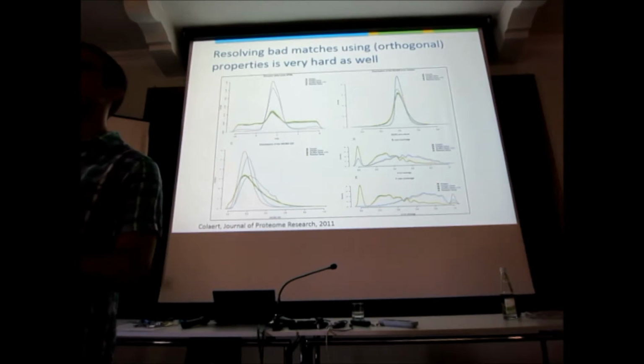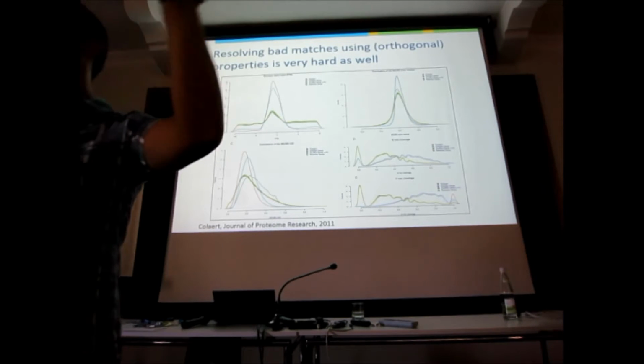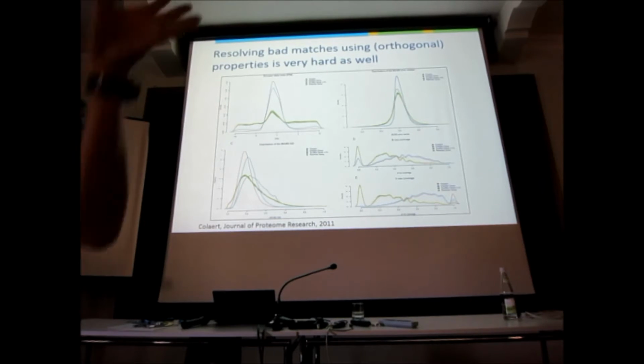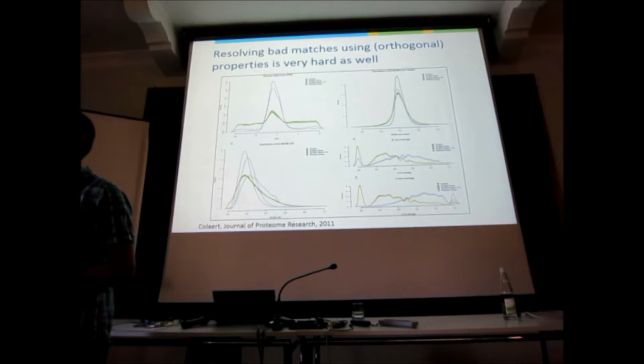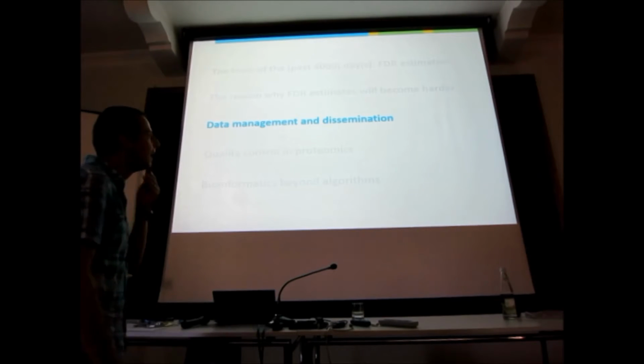And the target decoy approach does not compensate for this at all. The target decoy approach is Picasso's cubist picture against the normal peptide. And now we have lots of normal-looking peptides that all look alike. We need new tools, we need new stuff here. Yeah? So it's not a happy message unless you're a bioinformatician. Good, let's talk about something else.